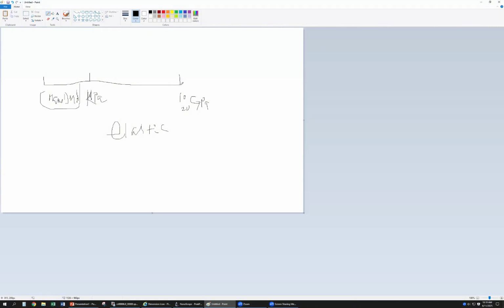So for the very hard sample, of all the cantilevers, the hardest one has K equal to 350. So that's not enough for something like copper or metal material, because it's too hard. For example, silicon, we cannot use it to get the silicon indent.